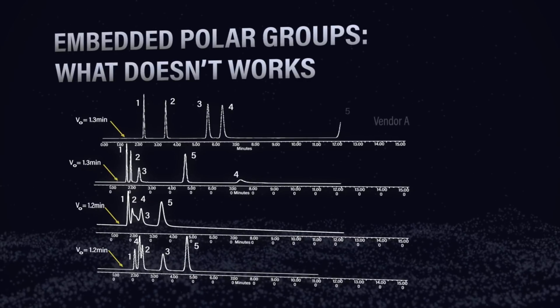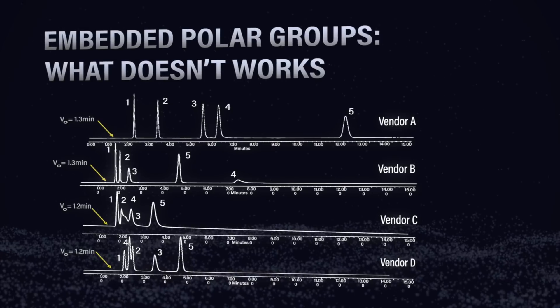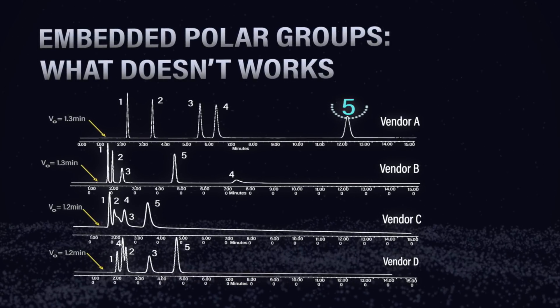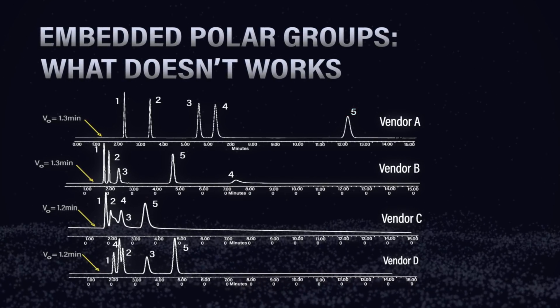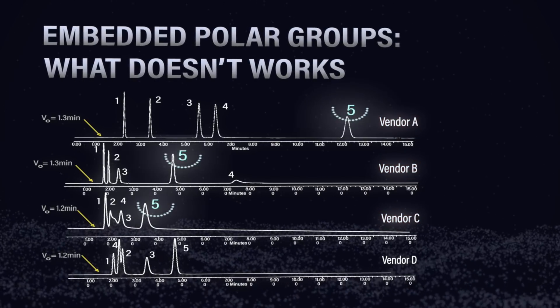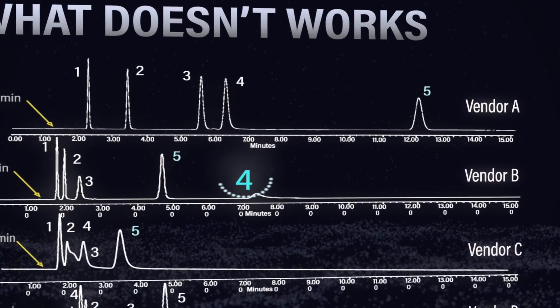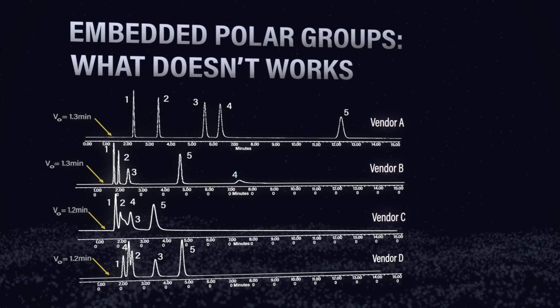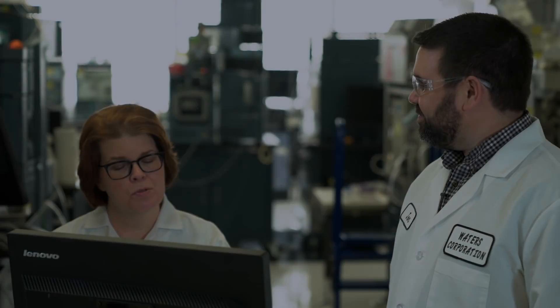Looking at the additional embedded polar group columns from different vendors, the retention isn't quite there. For thymidine 5-monophosphate (peak number five), the Atlantis T3 shows very good retention, but embedded polar columns from vendors A, B, and C show that peak number five is not well retained at all. For adenine (peak number four), the embedded polar group columns show poor peak shape — there is some retention but the peak shape is very poor.